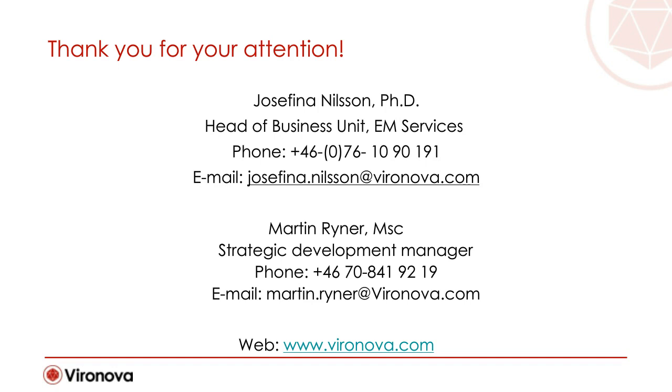Will you provide percentage aggregation? The quick answer is yes. It also always depends a little bit on the type of buffer used and if the visual observation can be linked also to other orthogonal methods, or if we can believe in the results. Every method that we design using the MiniTEM absolutely needs to be validated according to standards. So the quick answer is yes, and then we have to double check, of course.